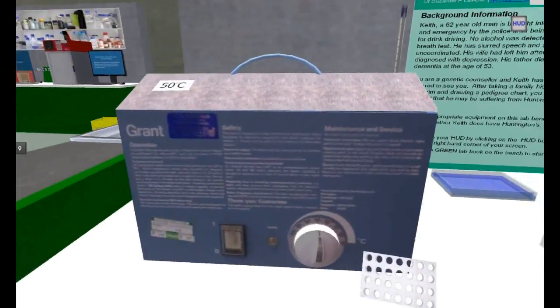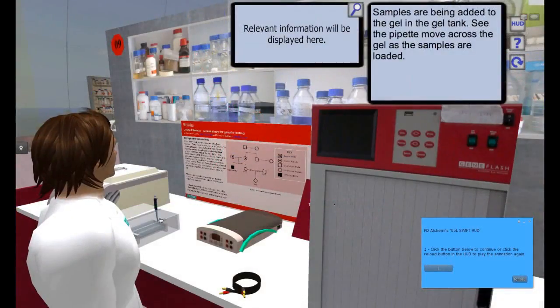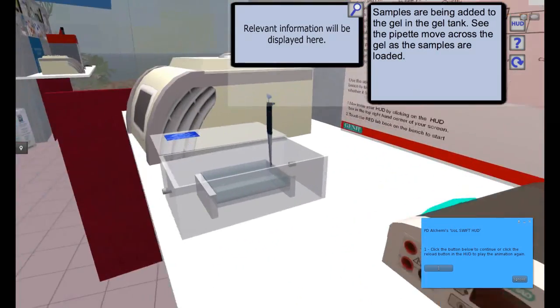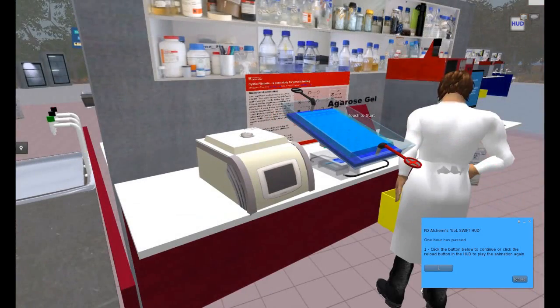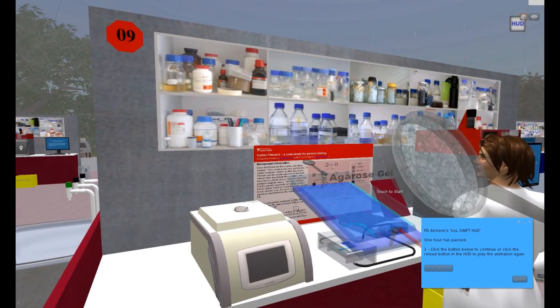The water bath, where reactions take place to cut the DNA. The gel, that separates DNA fragments by size. Again, an animation is shown to demonstrate the actual process.